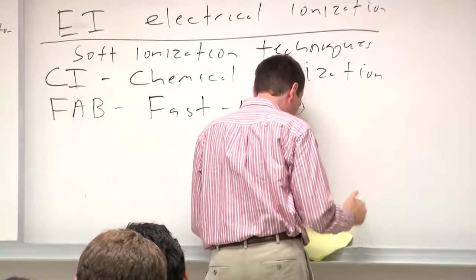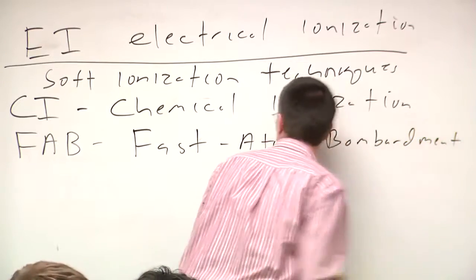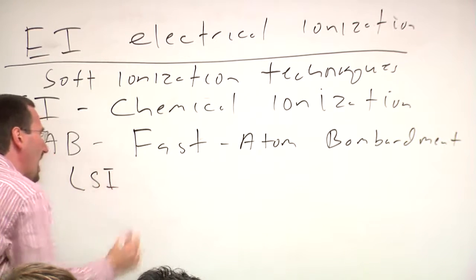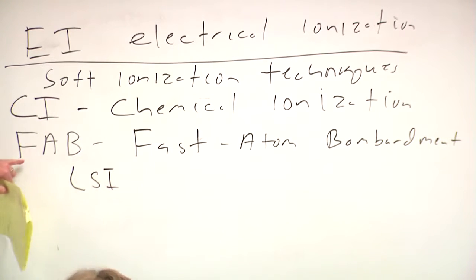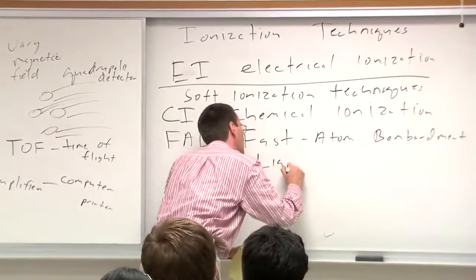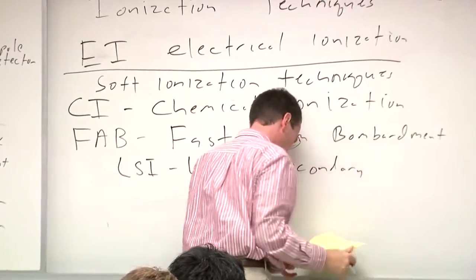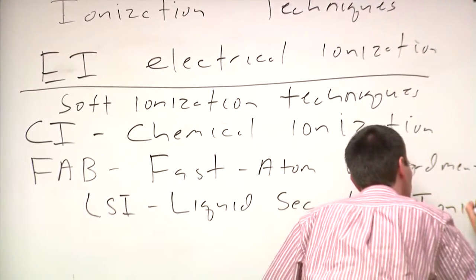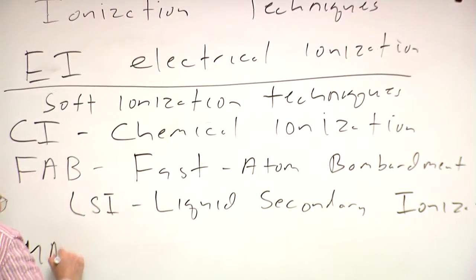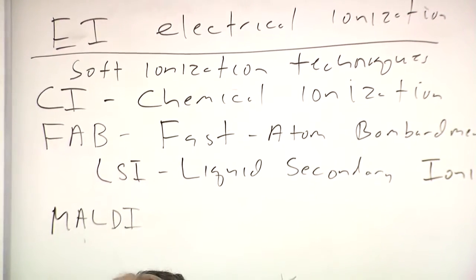And I'll show you more about these in just a second. There's a variant of this technique referred to as LSI. In one case, you're doing the business that I'll show you with an atom. In the other case, with an ion. And MALDI, M-A-L-D-I, is another technique for ionization and getting molecules into the gas phase.